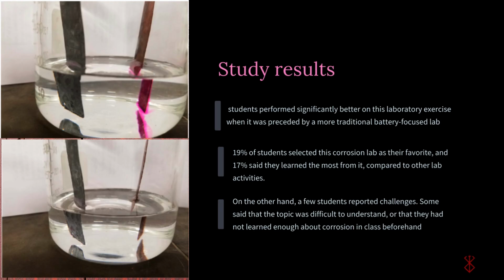The lab was run over 3 academic years with continued refinements and improvements, including better instruction and opportunities for discussion. Students worked in pairs, and the experiment lasted about 3 hours. A worksheet guided them through the theoretical content and the hands-on tasks, encouraging collaboration and critical thinking throughout the process. This kind of learning experience, where chemistry comes to life through visual reactions, real-world relevance, and direct measurement, makes a strong case for integrating corrosion into the electrochemistry curriculum.